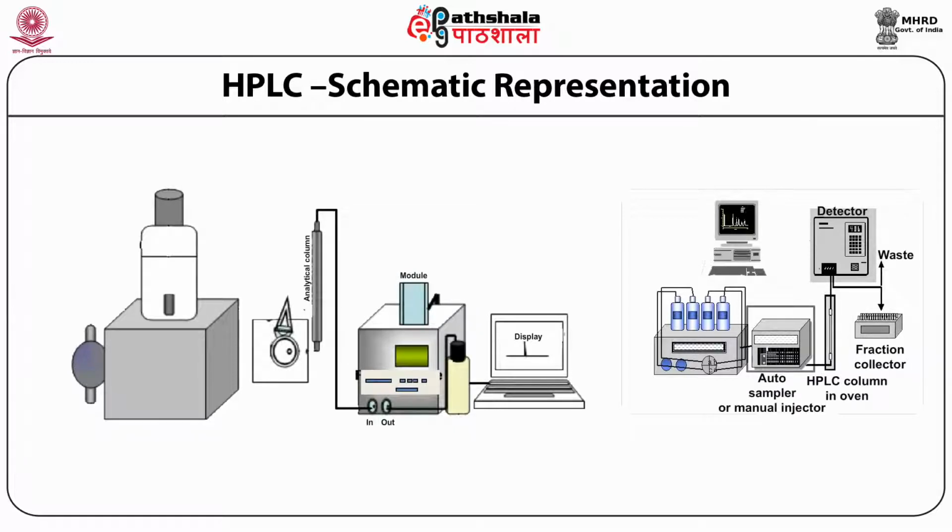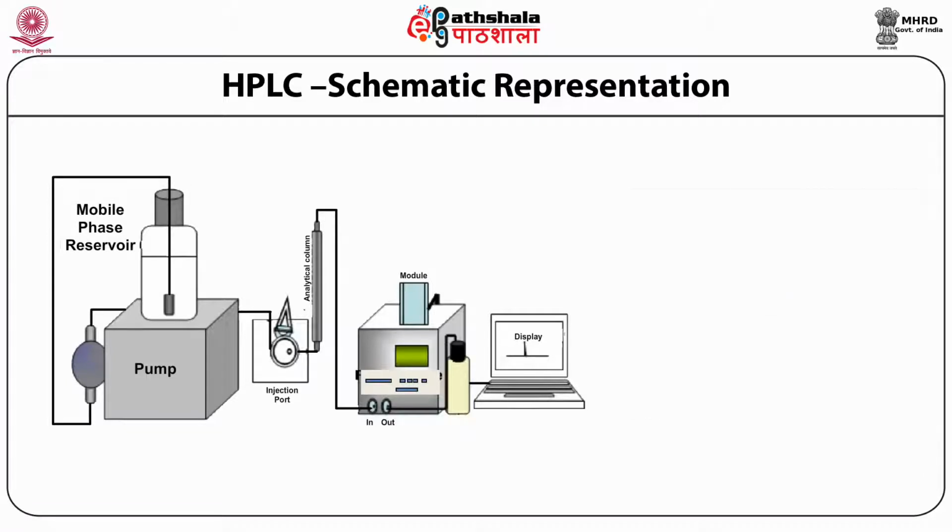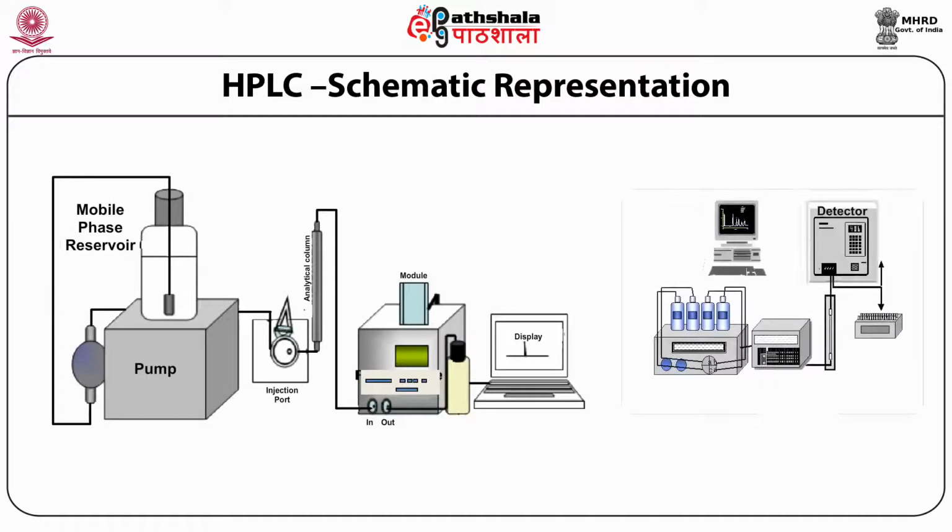What you see here is a mobile phase reservoir. Sometimes what you see here is an isocratic HPLC, in which water and methanol, water with acetonitrile, or methanol alone are mixed together and kept in the bottle, and it is being degassed.